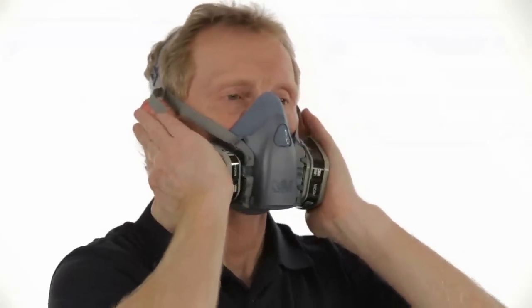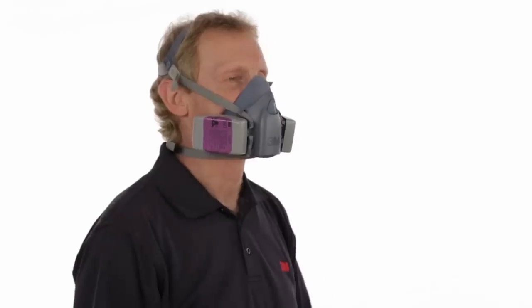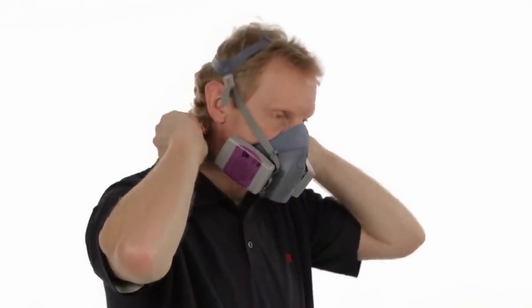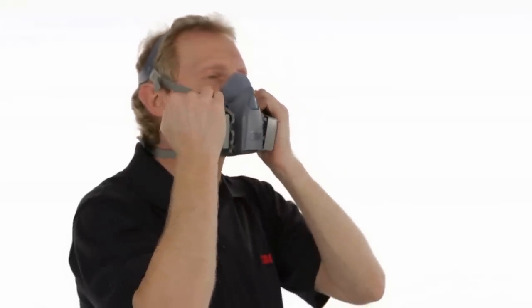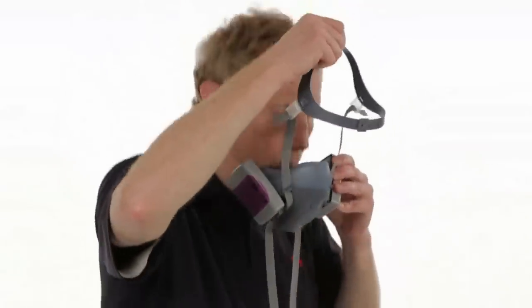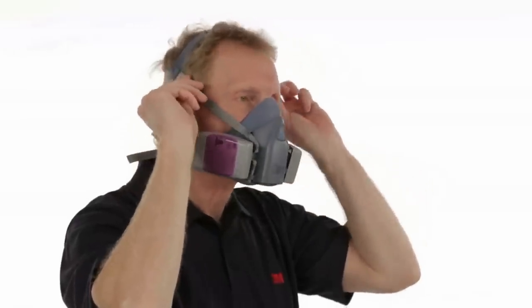To perform a negative pressure user seal check with cartridges, first cover the open area of the cartridge with the palms of your hands. Filter retainers may aid in conducting a negative pressure user seal check. To perform a negative pressure user seal check with the Round 2000 or 2200 series particulate filters, position your thumbs over the center of the filters to restrict airflow through the filter. After you've sealed the filter or cartridge inlet, inhale gently. If the facepiece collapses slightly and you feel no air leaking between your face and the face seal, your respirator has sealed properly to your face. If you detect air leakage when conducting either the positive or negative pressure user seal checks, reposition the respirator on your face or readjust the tension of the straps. Then repeat the user seal checks.